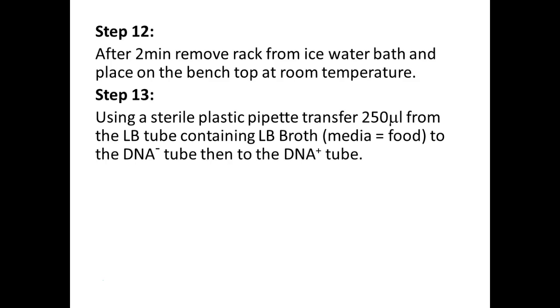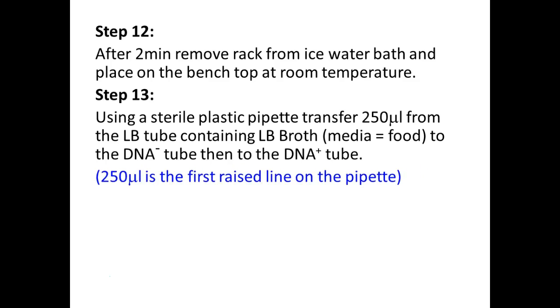We're not going to use the plastic pipettes in your boxes. I've sterilized some tips, and we're going to use the pipetmen. I'm going to give you a little tube containing broth, food for your bacteria, and you're going to feed them. It's already preset at 250 microliters. You can use the same tip as long as you don't stick it down into the fluid of each of your samples. You'll be able to draw up 250, put it into your minus tube, put it into your plus tube. And then we're going to let them sit.